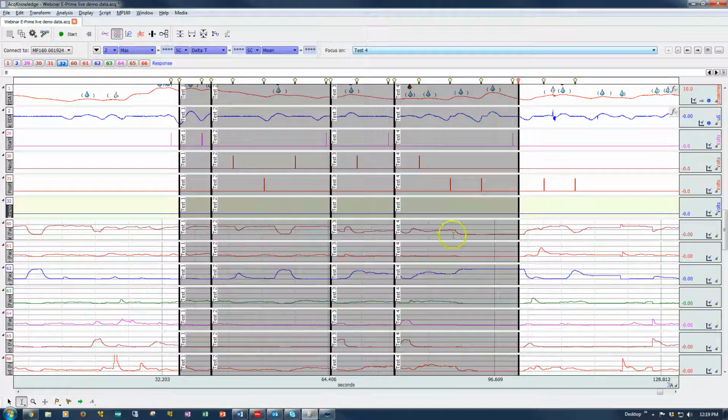Okay, that gives you a quick way to create focus areas that can then be used for specific analysis options. So if you want to run the electrodermal analysis across these focus regions, the results will be spit out for each region. Okay, so that concludes this screencast on focus areas and the Find Cycle detector.